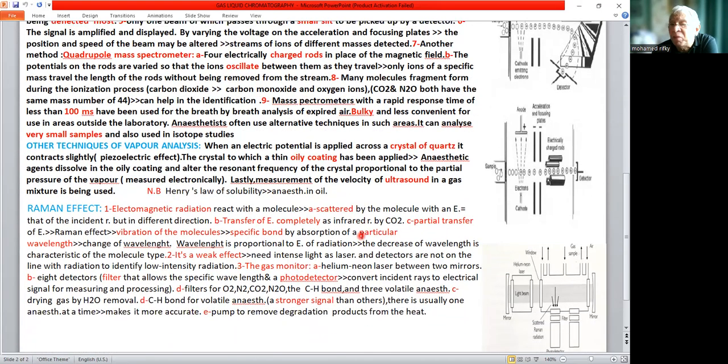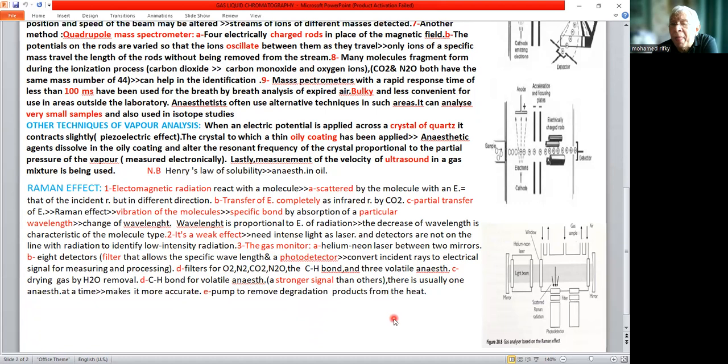The Raman effect is based on the observation that whenever electromagnetic waves are exposed to molecules, these molecules either scatter this incident ray with an energy equaling the incident energy, or absorb it completely, as CO2 absorbs infrared rays we mentioned before, or absorb some of this energy.